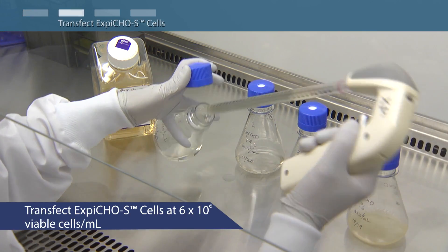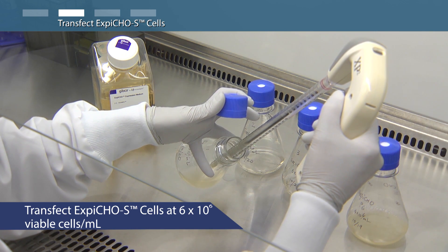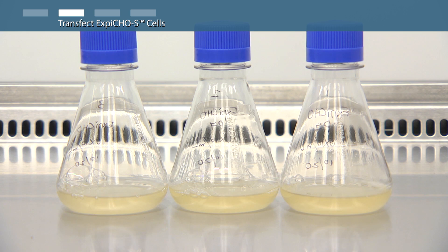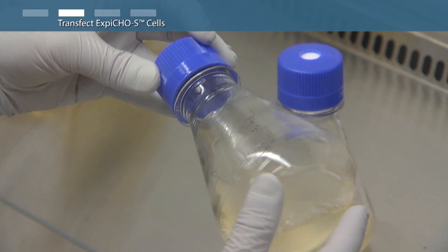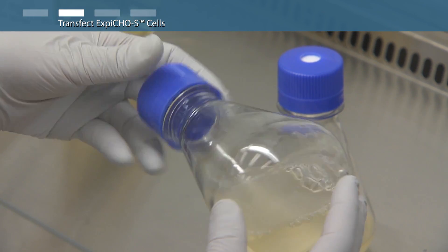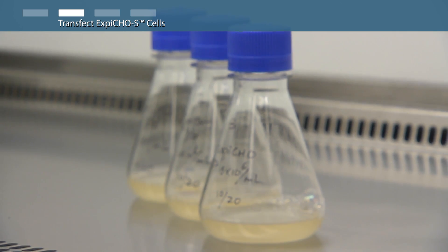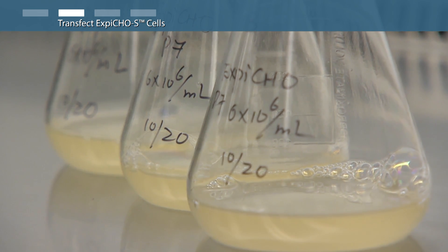Dilute the cells to a final density of 6 million viable cells per milliliter with fresh XBCHO expression medium pre-warmed to 37 degrees Celsius, with a volume of 50 milliliters in triplicate 250 milliliter shake flasks. Swirl flasks gently to mix the cells. The cells do grow fast, so only make this dilution within an hour or less prior to transfection. Discard any remaining high-density cells — do not reuse for routine subculturing.